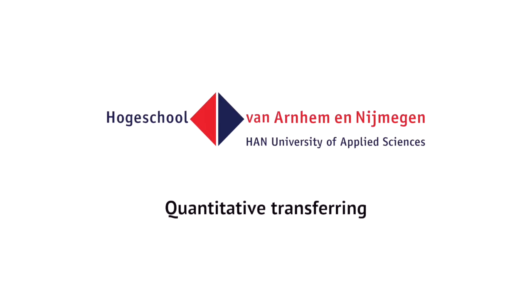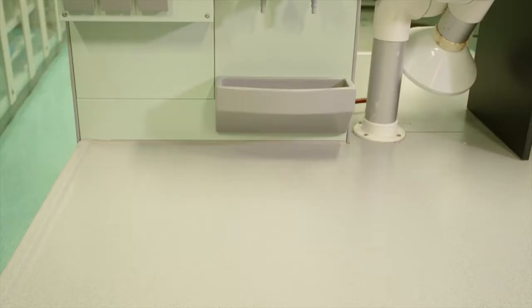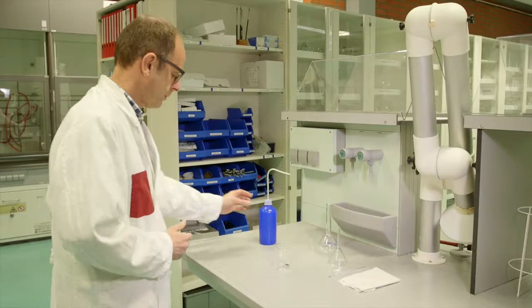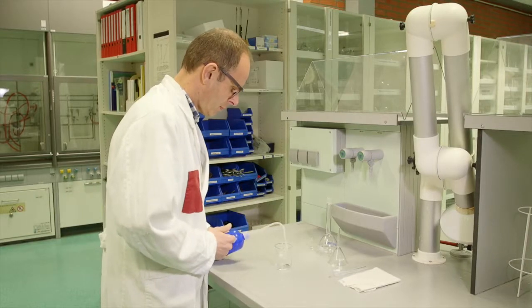How to transfer quantitatively. For quantitative transfer, the following materials are required: a beaker with a chemical, a solid to be dissolved, a measuring flask and stopper, a glass stirring rod, funnel, paper clip, bottle with demi-water, Pasteur pipette, and paper. The solid is dissolved in water or another suitable solvent.